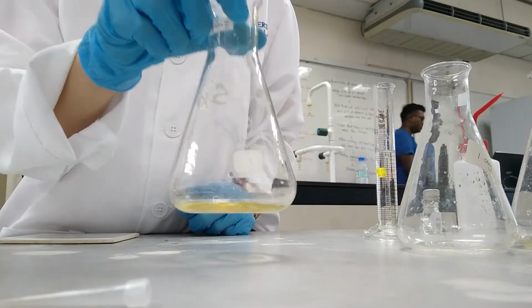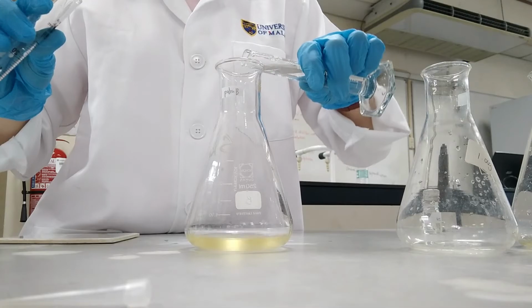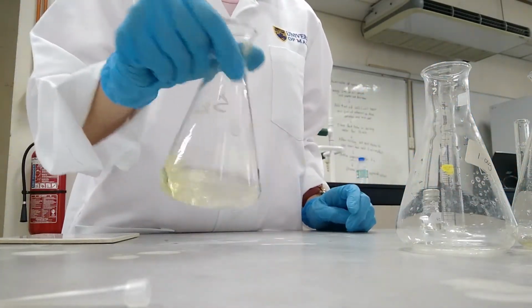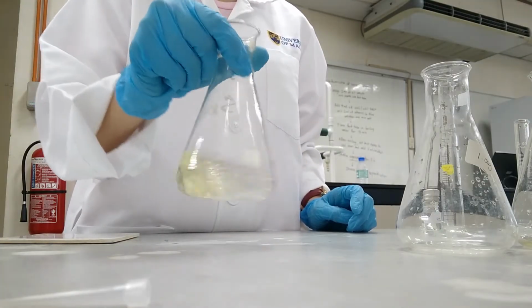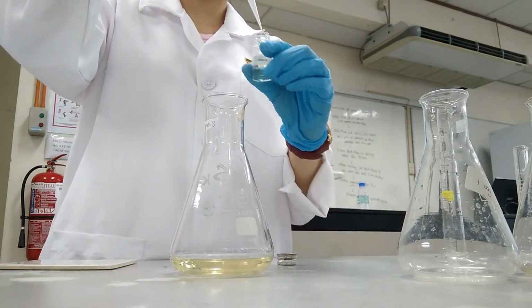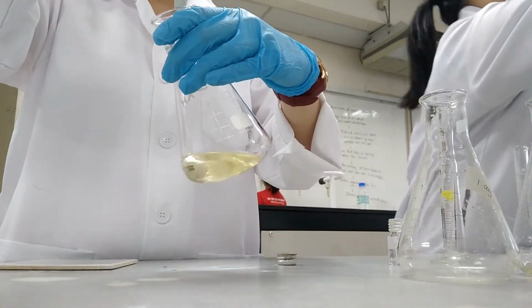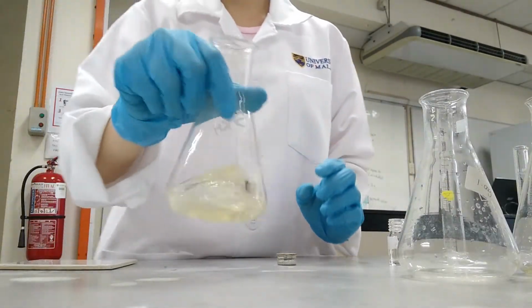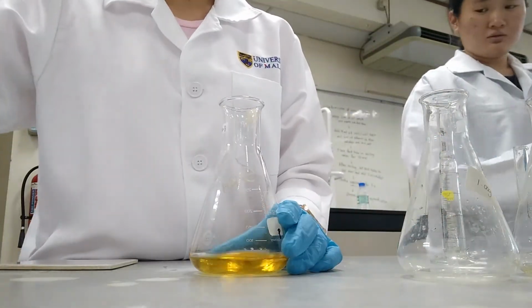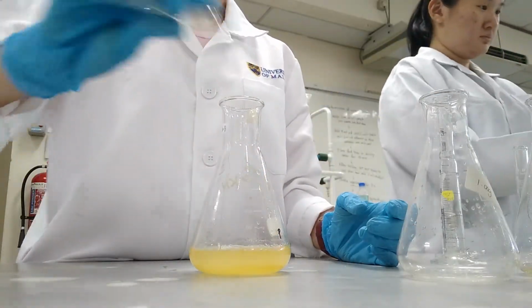5 grams of oil sample was weighed in a conical flask. 30 ml of acetic acid was added into the oil sample and mixed well. 0.5 ml of potassium iodide solution was added and the solution was shaken for 1 minute. 30 ml of distilled water was added into the sample solution and shaken well.